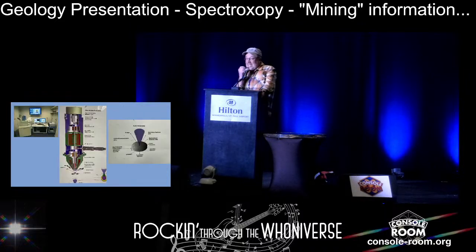So we use a tungsten filament in this particular instrument. If you can see the little blue, I don't know if you can see the mouse, the cartoon here is a blow-up of the column. We have a tungsten filament in there which we heat up to a few thousand degrees Fahrenheit. We draw the electrons off. The filament is exactly like an incandescent bulb. It's a piece of tungsten.